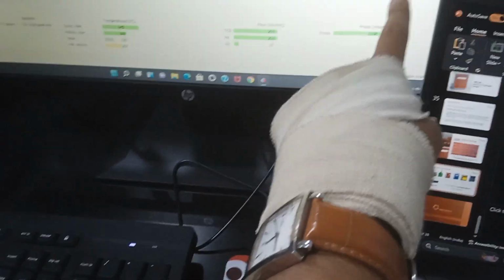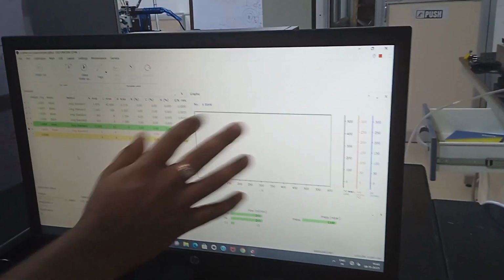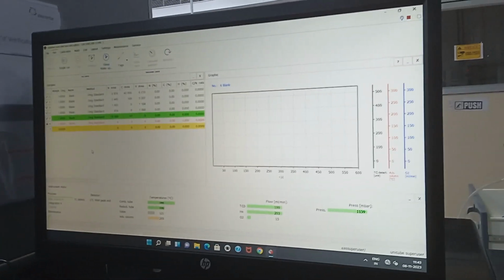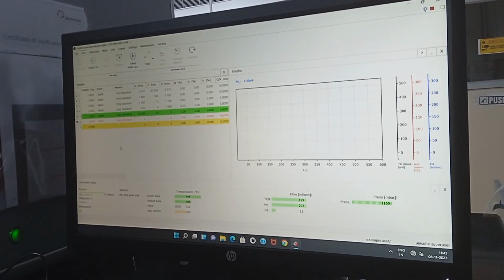Let me understand what these units are, could you explain? I'll show the screens actually. This is the sample screen. This is the graphic screen, which means graphs will indicate. And this is the instrument status. And this is the menu bar. This is the title bar.